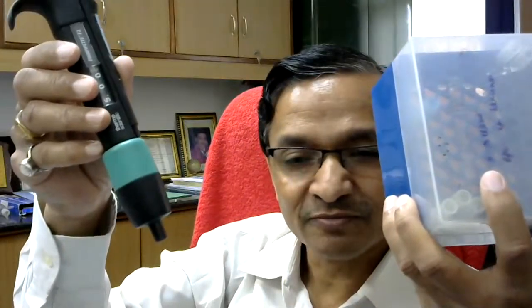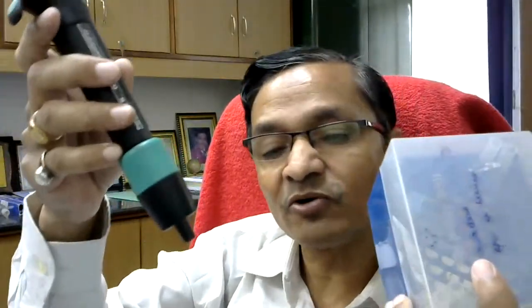Similarly, for this 5 ml pipette, you cannot use 1 ml tips. Even if you somehow try to fit it, the capacity of the tip itself is 1 ml, so how can you take 2.5 ml or something like that?